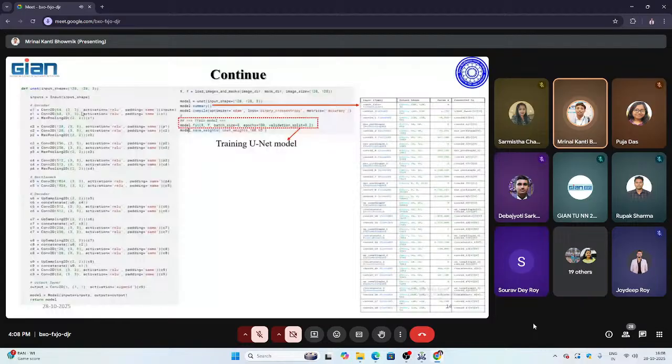So padding is necessary. First of all, two convolutions are done, which I have considered as 64, 64, and then a 2 by 2 max pooling is done, as I have shown, where among 4 they choose one, maximizing the pixel value, which is the greatest among the 4. In this way, the encoder has max pooling for 4 blocks, and then in the bottleneck there is no max pooling.